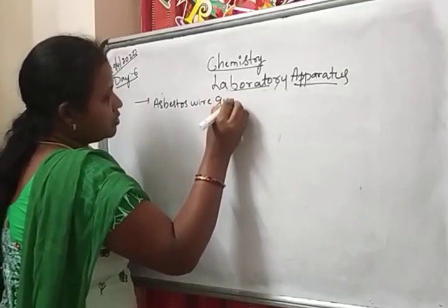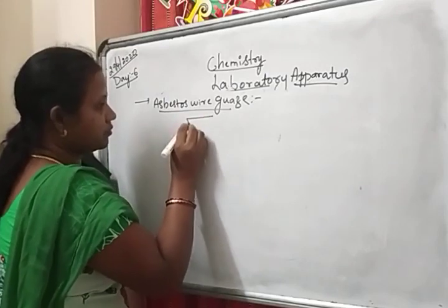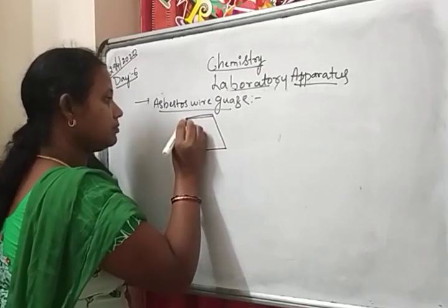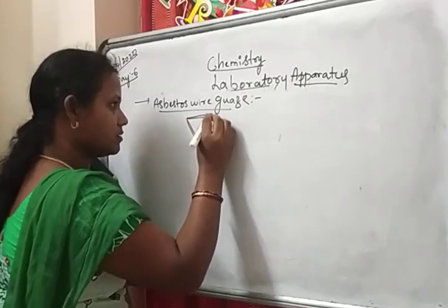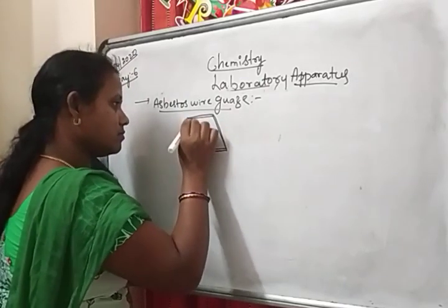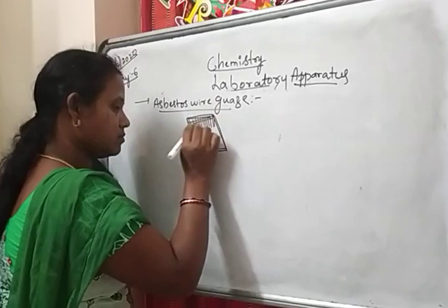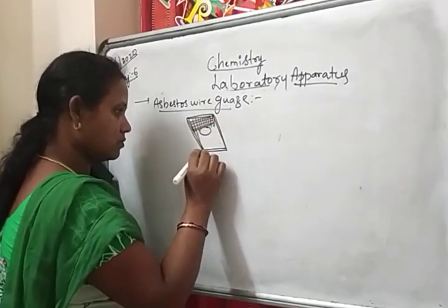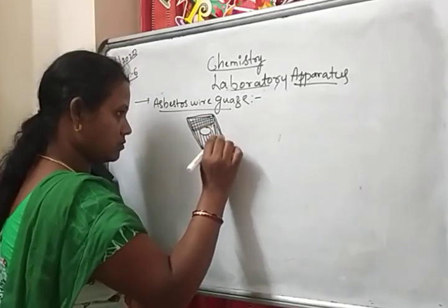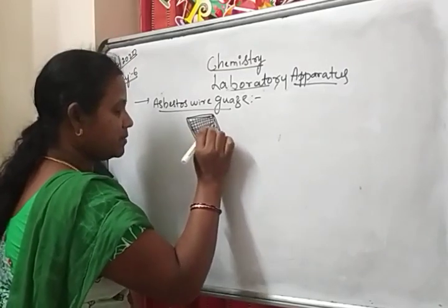How is this asbestos wire gauze? This is the asbestos wire gauze.